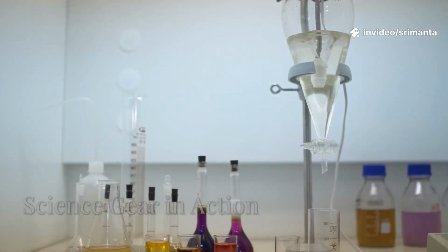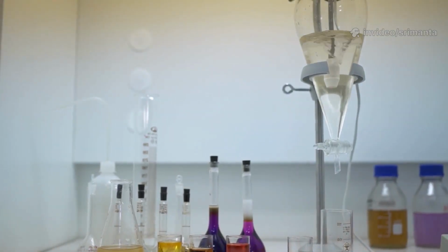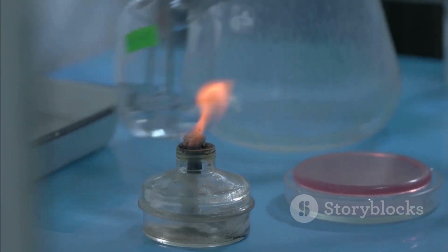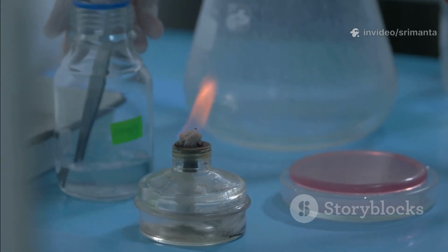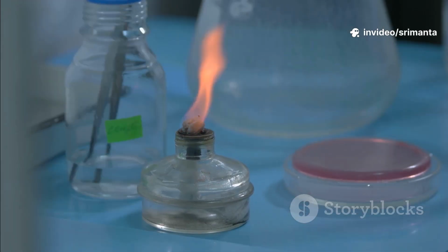To perform this test, we need a special piece of equipment called the Gutzeit apparatus. It sounds fancy, but it is quite simple. It is basically a wide-mouthed glass bottle with a stopper. The bottle is where all the chemical reactions happen. It is where we mix our sample, the acids, and the zinc to generate the arsine gas.